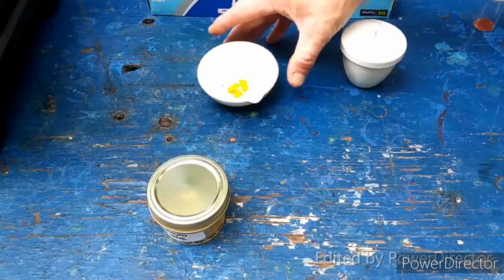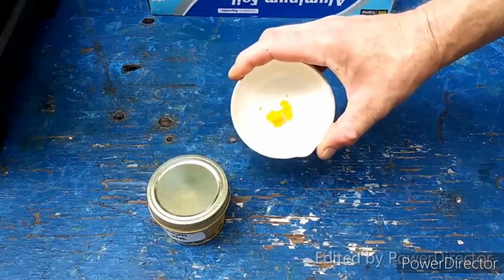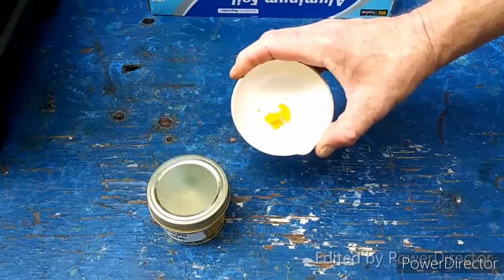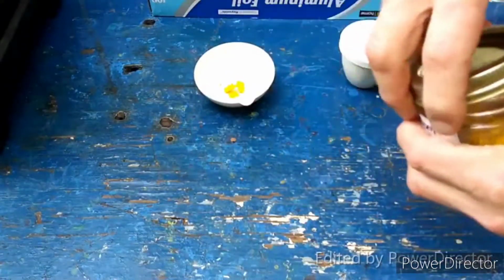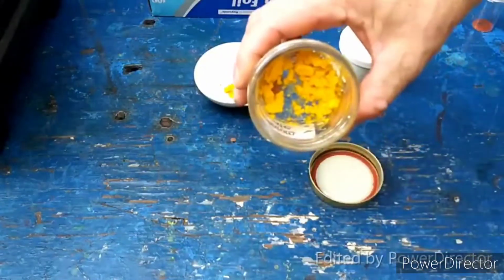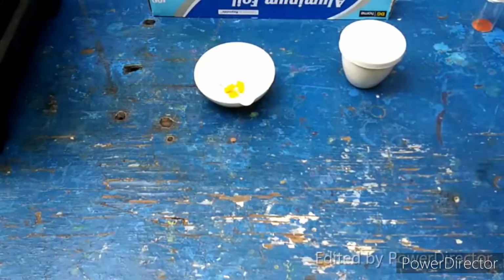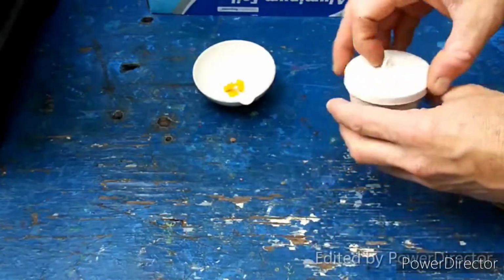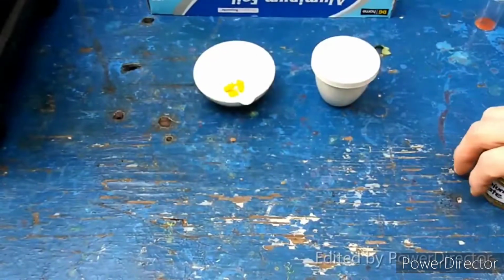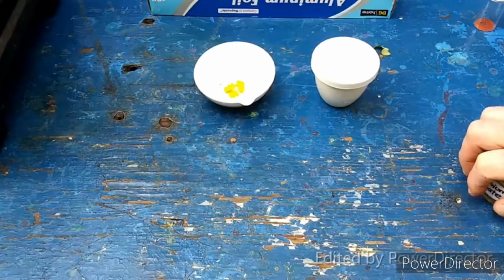For our attempt to make the uranium trioxide, I've got 2 grams of ammonium diuranate that I prepared from the other 4 grams of uranyl nitrate that I had in solution that I never did anything with in the previous video. There's the rest of it. Isn't that pretty? What we've got over here is 2.5 grams of ammonium diuranate that we are going to try to use to prepare Urano-Uranic Oxide, also known as Triuranium Octoxide. That's such a cumbersome word to say.